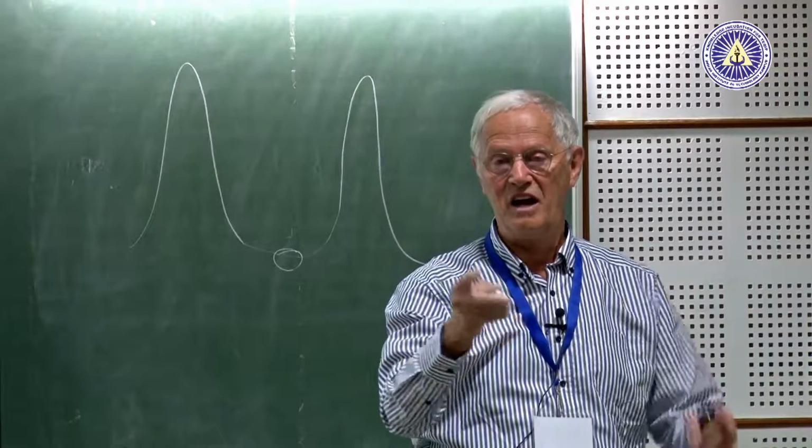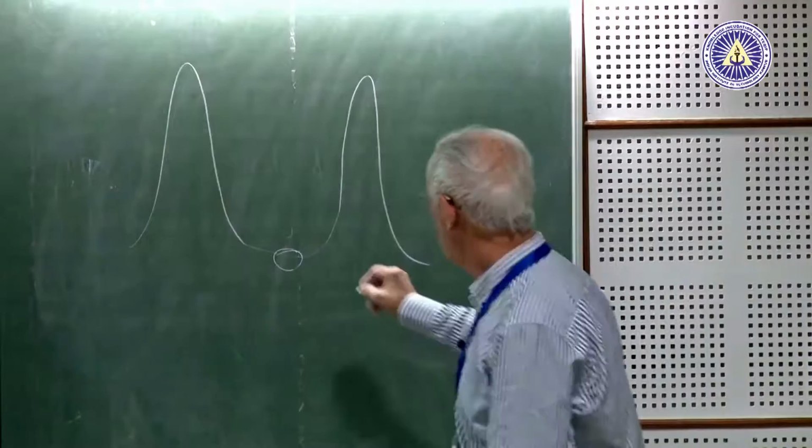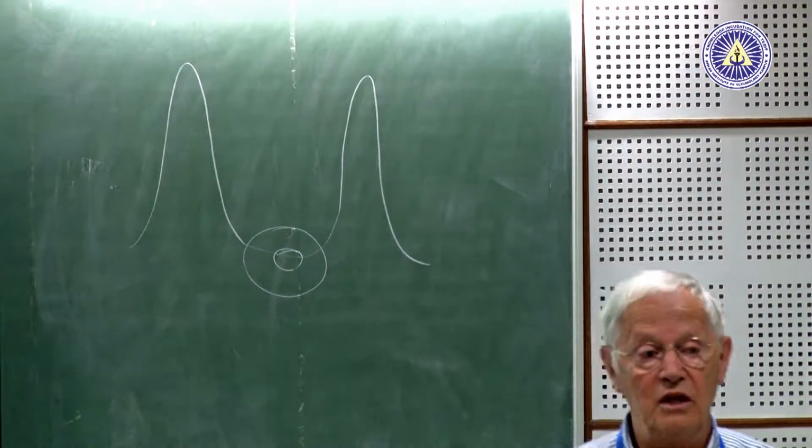Halfway between two Bragg reflections. You would have to measure what is here. In principle you can do it, but I think practically today it would be difficult. So the further you go away from the Bragg peak, the closer you go to the dislocation. And you are at the core when you are halfway between two Bragg reflections. That is just the idea of reciprocal space.